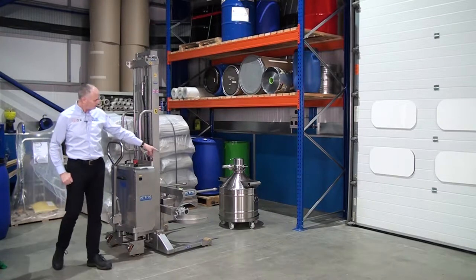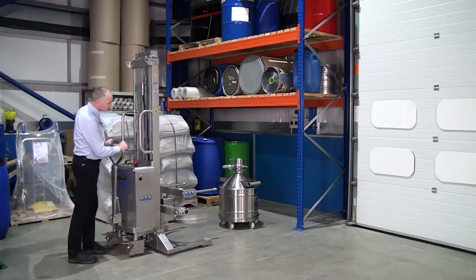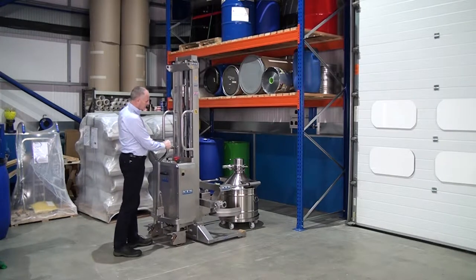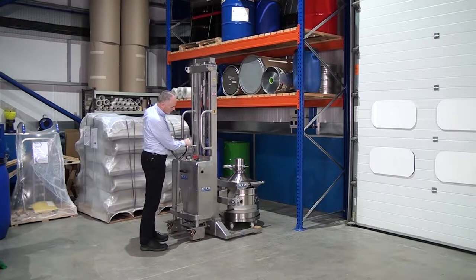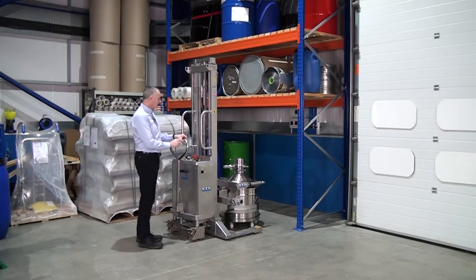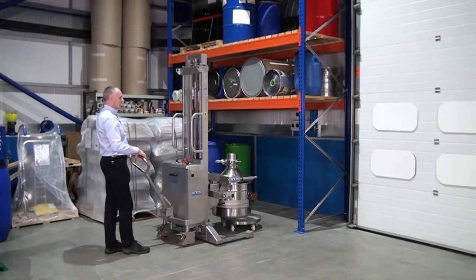We're going to show you now entering the forks into the vessel to set the height. We wheel in nice and gently all the way in so we see the band touching the back of the drum. Then we can press lift and pull a bit back from the rack in.